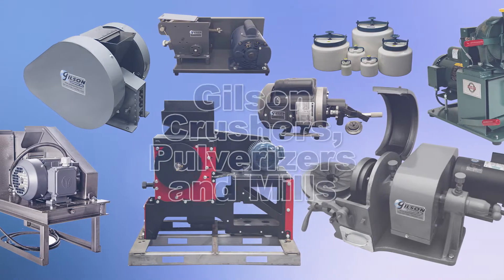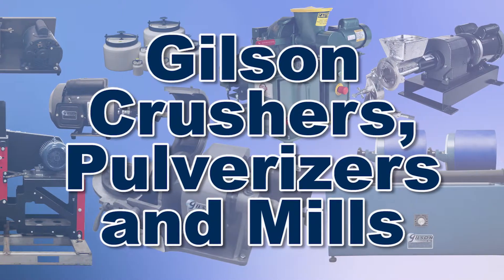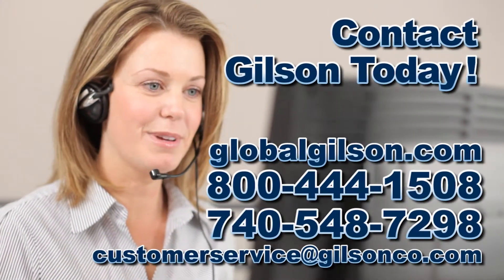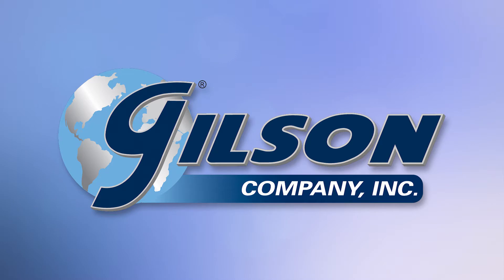Gilson offers these and floor and bench top models, offering a wide range of performance features and capacities to fit your needs for fast, accurate, and reliable crushing, pulverizing, and milling. Be sure to check out these and all our products listed in the Gilson catalog and on the Gilson website. Gilson — your industry leader for materials testing equipment.